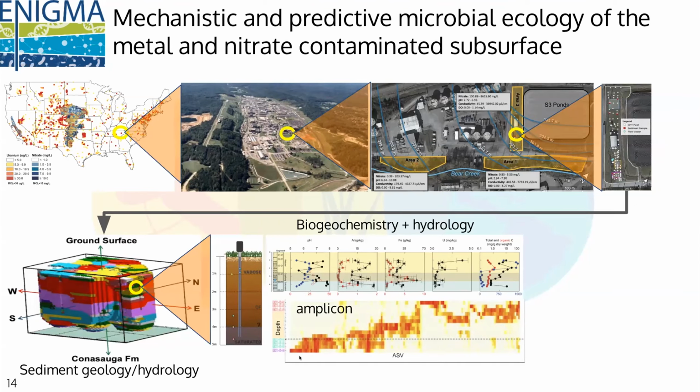And this is just an example of amplicon data arrayed from one of our sediment cores. So this is a single time snapshot where we took a big bunch of sediment out of the earth, and we cleaved up that sediment into different regions by depth. And we measured who was there. And so on this axis, it's the sample, which is a particular XYZ location. And then on this axis, it's the exact sequence variants, or ASVs, where we can see that they're highly stratified in space in this location. And they have some amount of correlation or association with the chemistry that we see here.